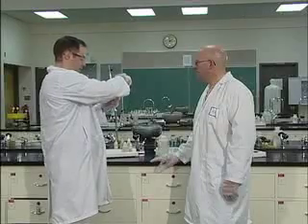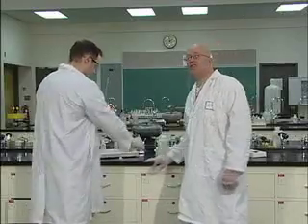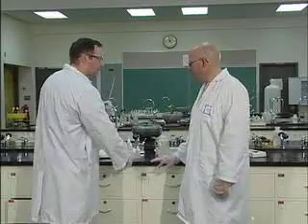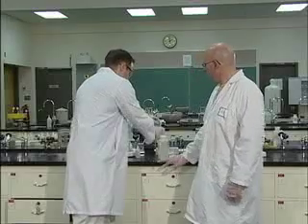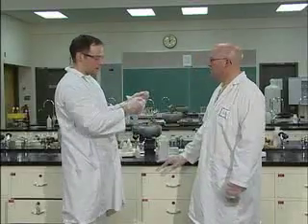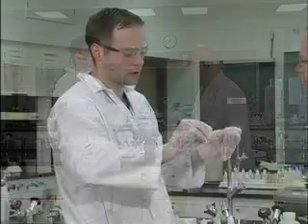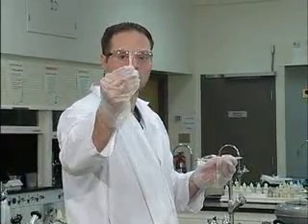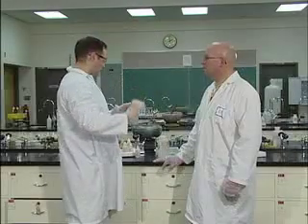Okay, so we're going to add this calcium oxide and we should see something happen. Oh, I'm excited. Before we do that, we have to do our litmus test. And the easiest way to do that is to take your thermometer out and dab your litmus on the end of the thermometer. Nothing's happening. No, it's just getting wet. You should get something that looks like that. It didn't change color.